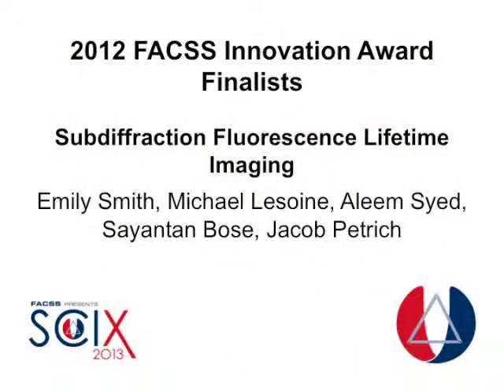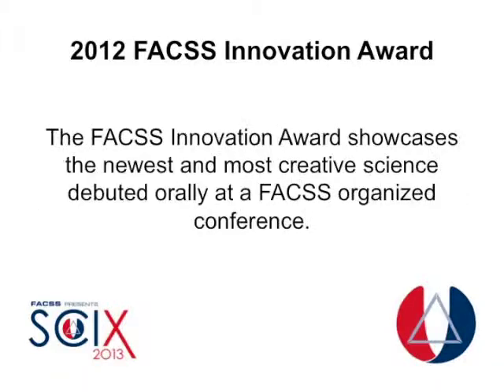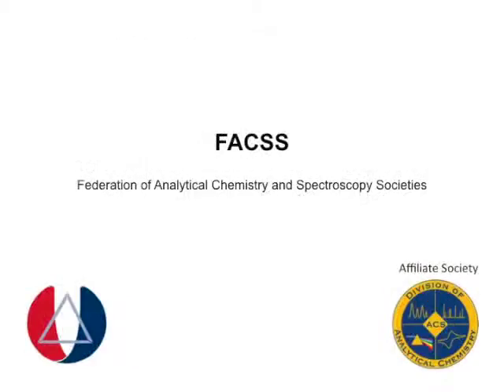The main idea behind what my collaborator, Jake Petrich, also in the chemistry department at Iowa State University, and I have done is we've binned the spontaneous fluorescence signal that we're collecting in time. And that allows us to extract the fluorescence lifetime in subdiffraction volumes. So we're able to do subdiffraction fluorescence lifetime imaging with 40 nanometer spatial resolution.